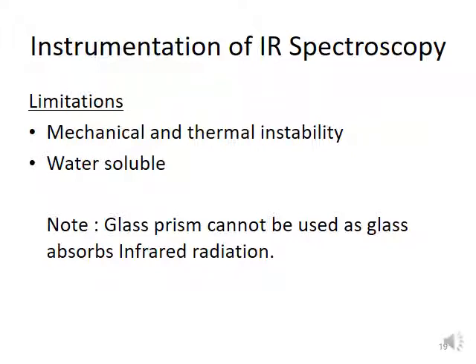There is always a limitation in instruments. Okay, so for the infrared spectroscopy, as you all know, it is a very simple setup of instrument. Limitation in IR spectroscopy number one is the mechanical and thermal instability.